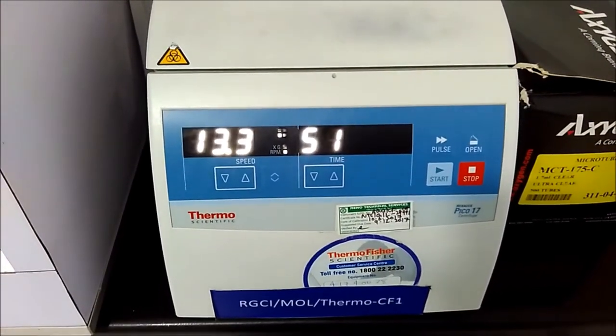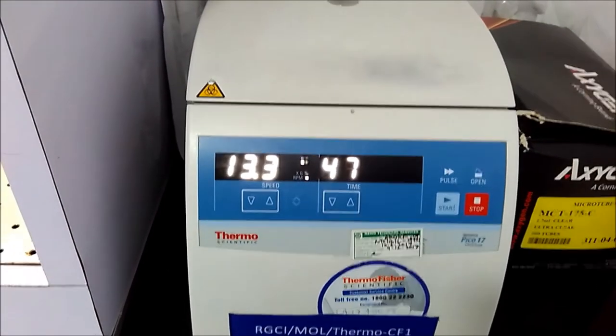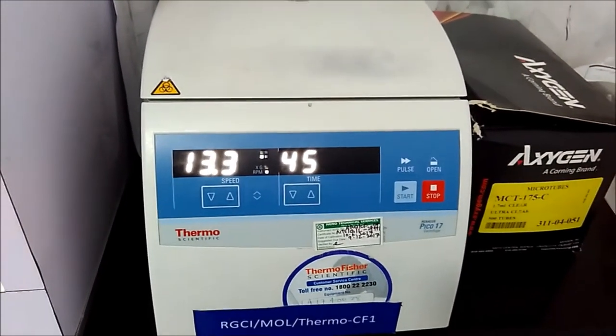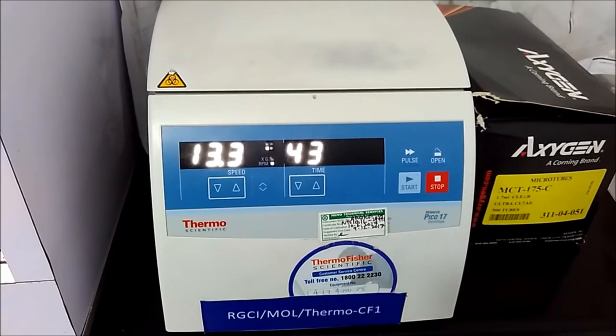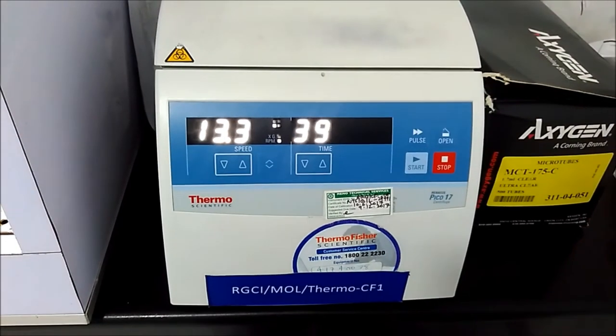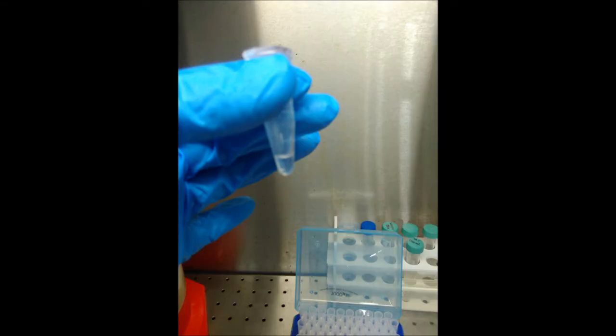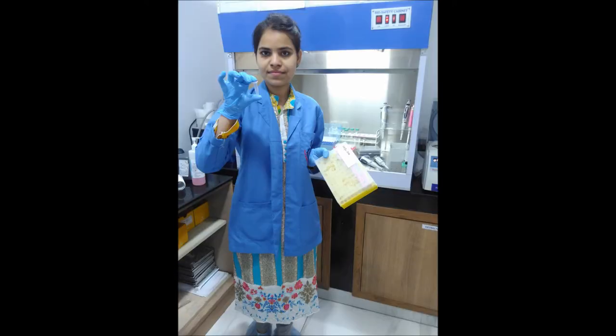We spin at maximum speed — 13,000 rpm — for one minute. This is the final step. After one minute, we will have the nucleic acid that we have extracted. Thank you so much.